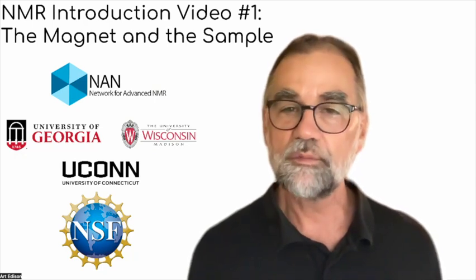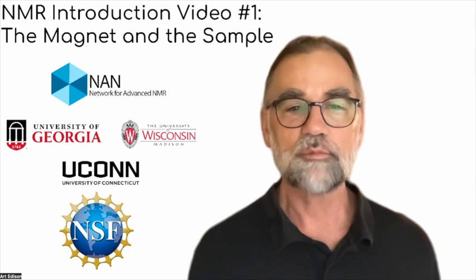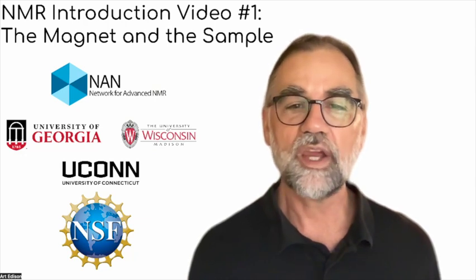This first simple video introduces the basic concepts: the magnet, the sample, and how they interact. I hope that you enjoy it.